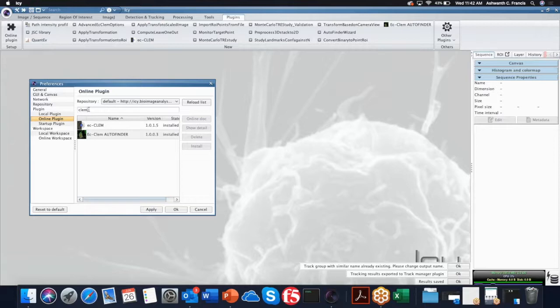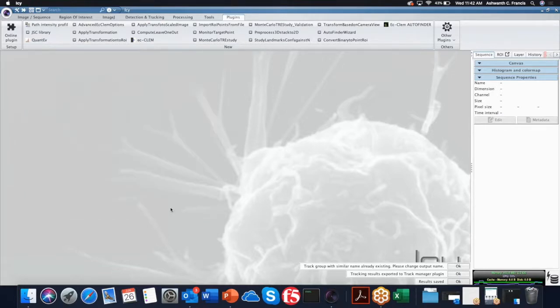Yeah? So you simply say install. Just click on eC-CLEM and say install. And after it's installed, just say apply and say okay. Then you'll have it on your plugin list.